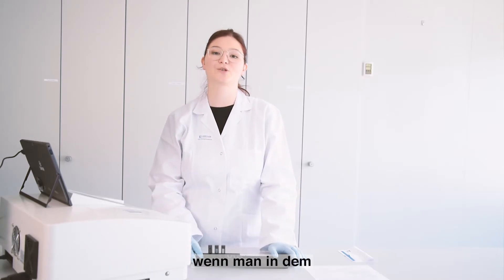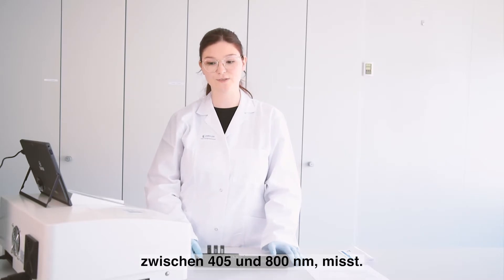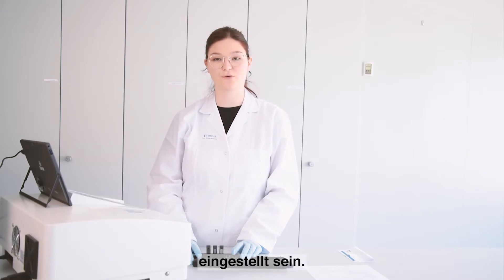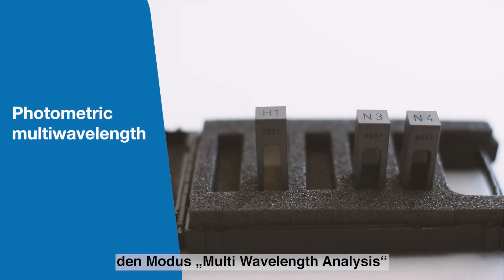These filters are an excellent choice when you measure within the visible wavelength range from 405 to 800 nm, and in the PC software you should set the wavelength range to 440 to 635 nm.